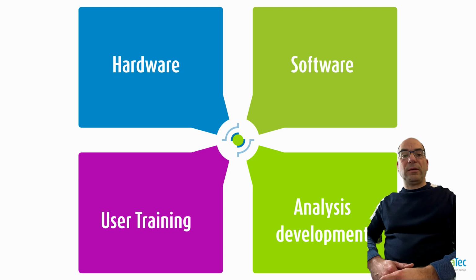What do you get when you acquire a plant phenotyping system at LemnaTec? Hardware, software, introductory training, analysis development? Let's have a closer look. Hello, this is Markus Jansen from LemnaTec.